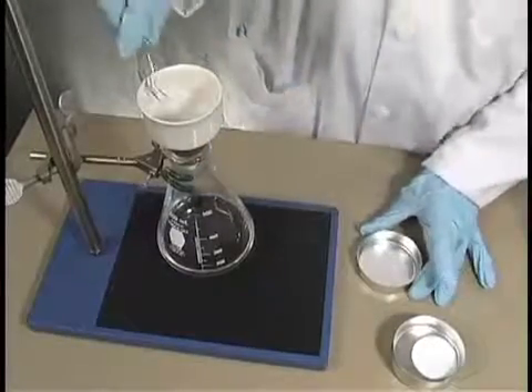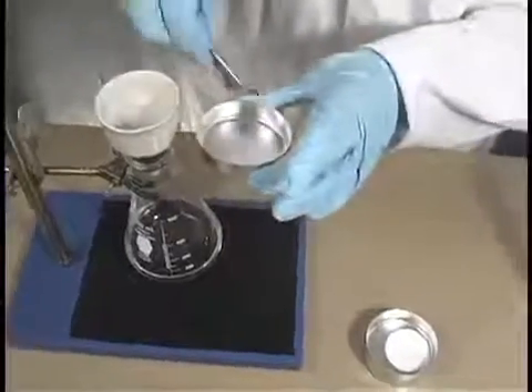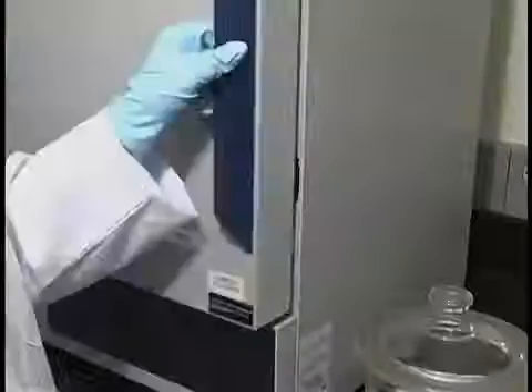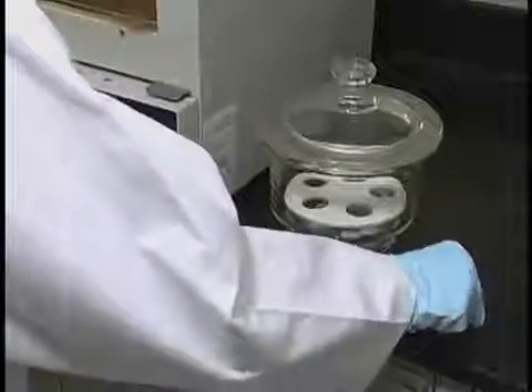You will then need to remove the filter and place it back into the pan. Then place the pan with the filter into an oven. The filter needs to be dried to a constant weight at 103 to 105 degrees Celsius for at least one hour.